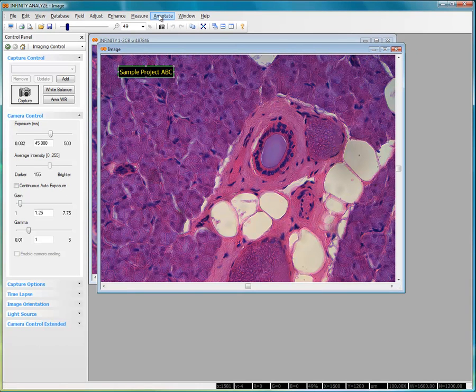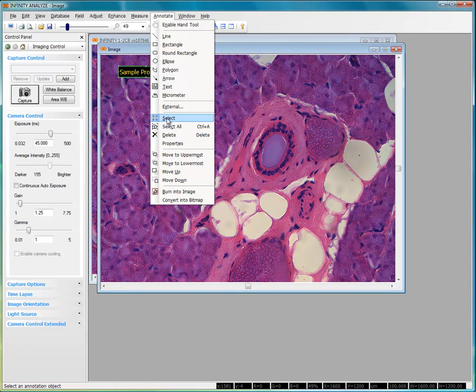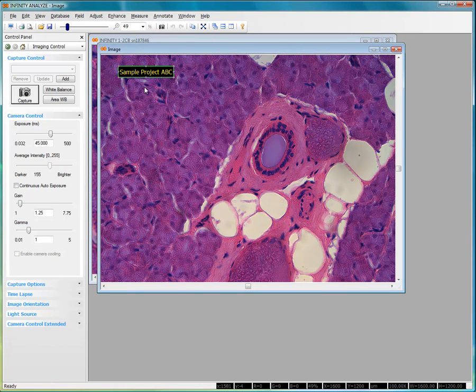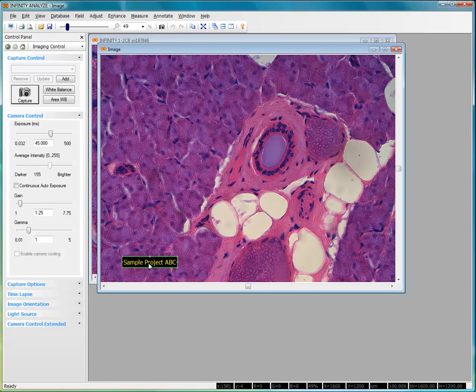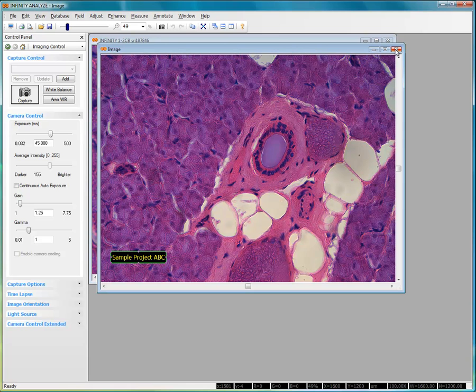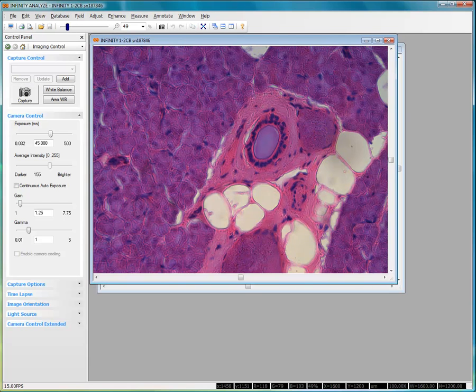If I choose Select here, I can move this annotation text around just for illustration purposes. Now, returning to my Live Preview window.